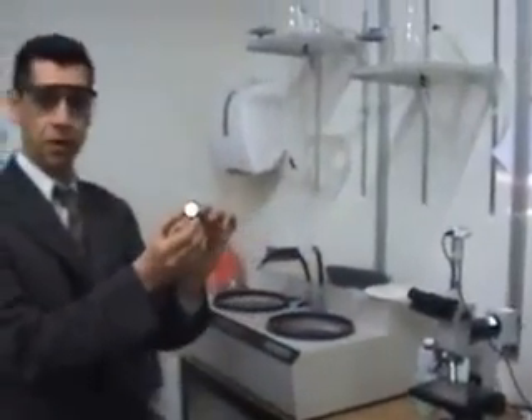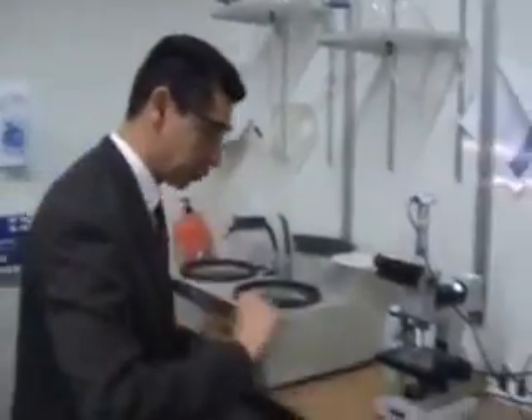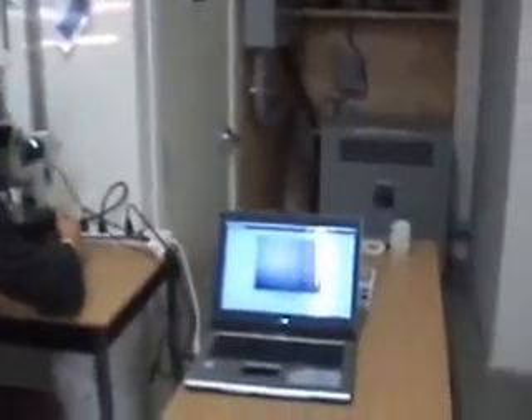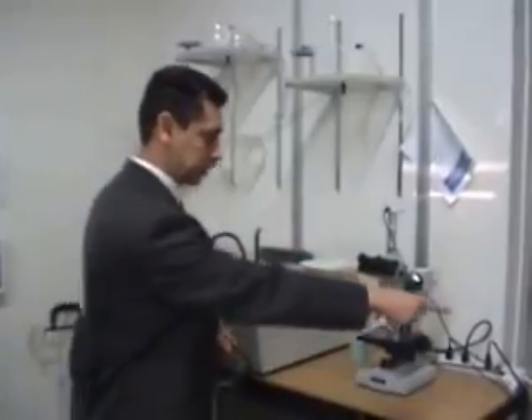What we have here is already a fairly polished specimen. When you have this specimen and you want to look at the microscope, the first thing is to try to look at the lowest magnification to find the adjustment. I try to bring down the lens until I increase the intensity of the light. A polished specimen looks something like this. We won't be able to see any grain boundary unless we etch the samples. Etching means introducing a mild corrosive liquid, which is mild enough not to corrode and oxidize the grain, but corrosive enough to oxidize the grain boundary — the areas that are higher energy and more susceptible to corrosion. Then we will be able to see actual grain boundaries.